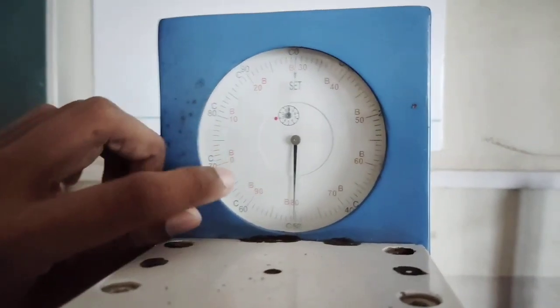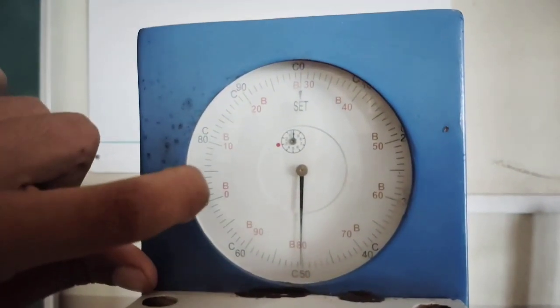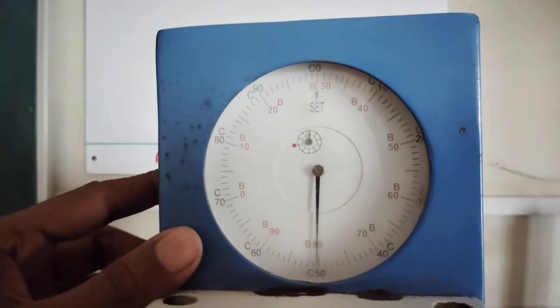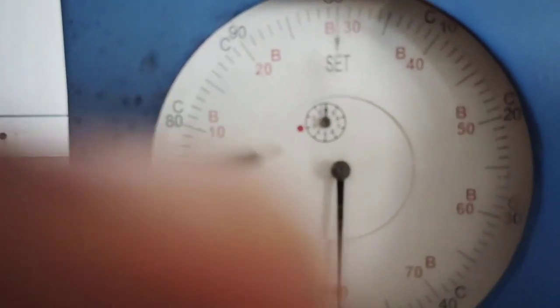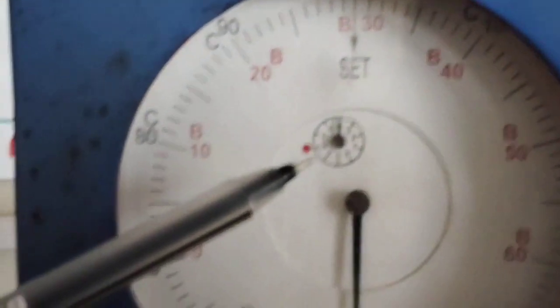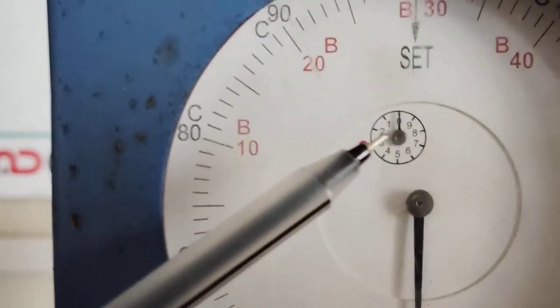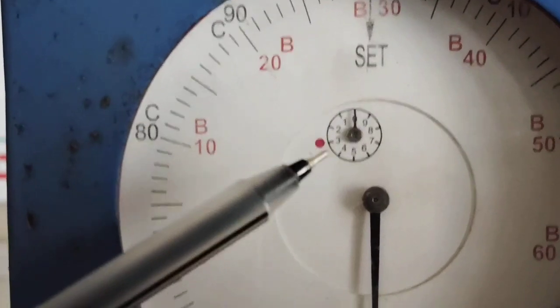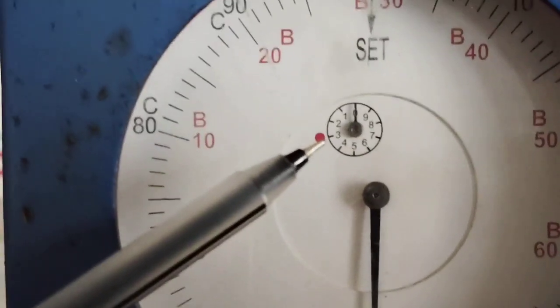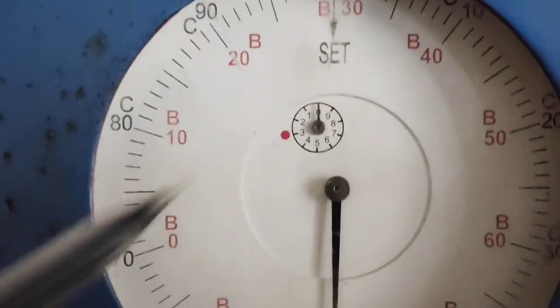The dial gauge has a red reading on the inner side and a black reading on the outer side. On the inner side, we can see a small dial. This dial tells us that the minor load applied should not be greater than this mark at 3, as you can see at the red dot.